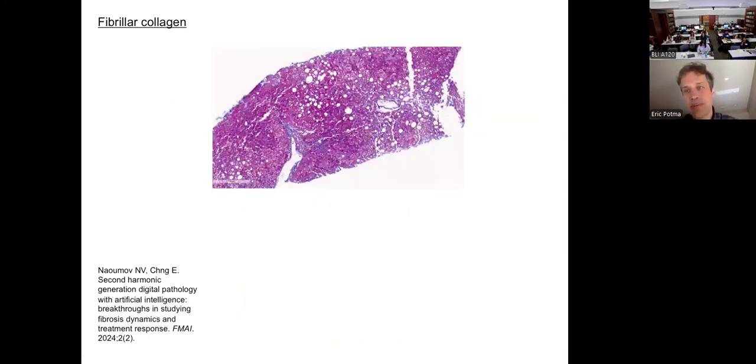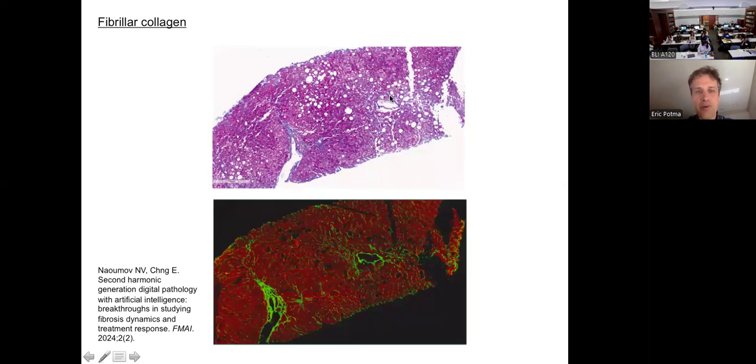Now second harmonic generation is very popular. If you take a tissue sample like this, and there are many, many examples in the literature, this is an H&E stain, but if you do, for instance, fluorescence and second harmonic at the same time, you can see beautifully where the collagen sits here in green. You don't have to label anything. It's very high fidelity imaging. And in this case, people have studied the effects of fibrosis. In fact, fibrosis detection is an important application of second harmonic generation.